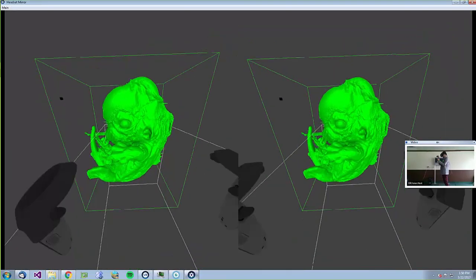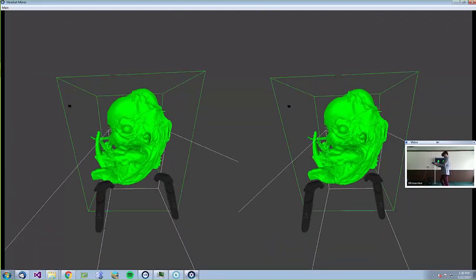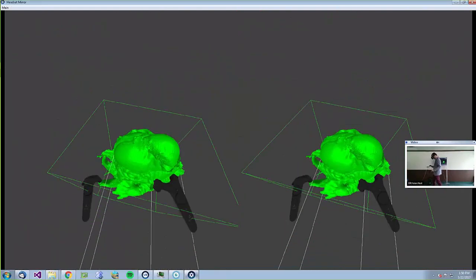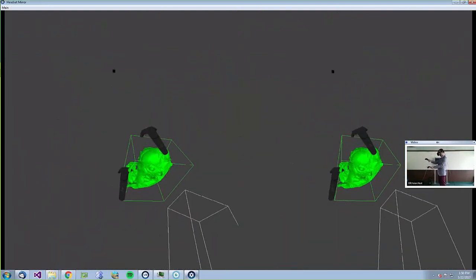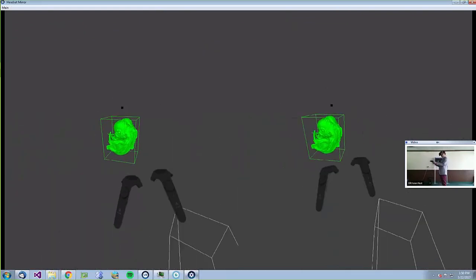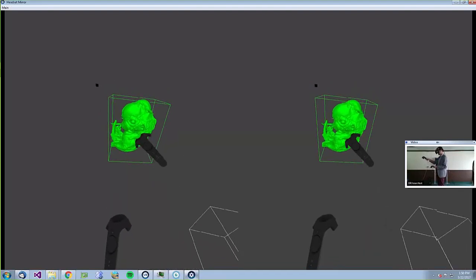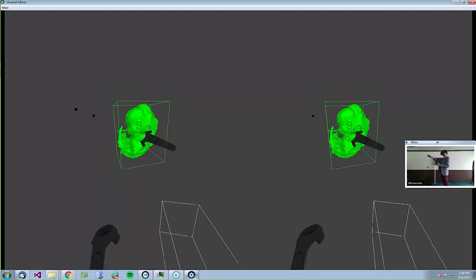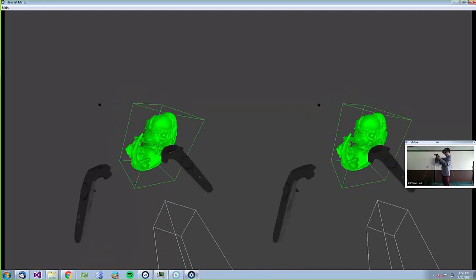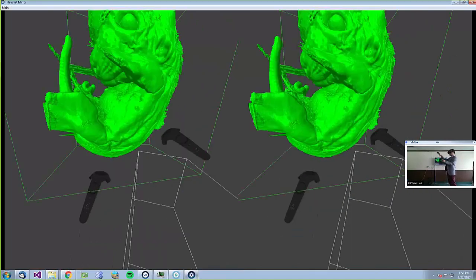right now. So in my view is about 5'10". I can make them first smaller. If I had multiple embryos here, for example, I could have one here, one there, one there, and see all of them and compare them. But in this case, I just have this one single embryo, and I'm interested in looking at what's inside him, looking at some of his structure. So I can make him a little bigger, I can expand him.